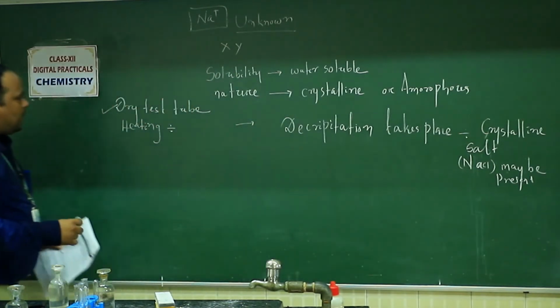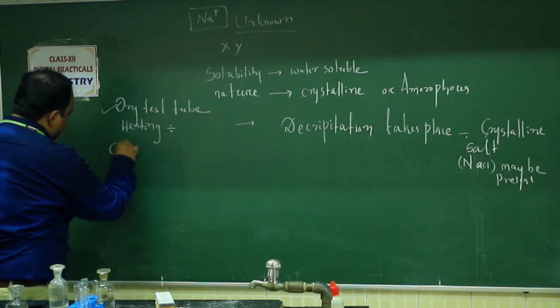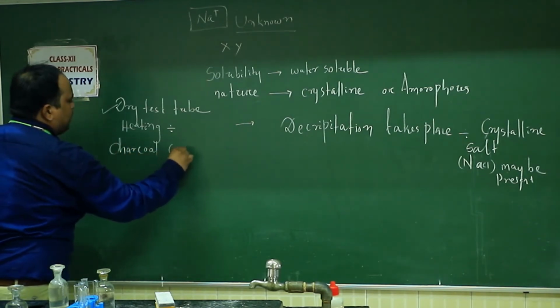Next, after dry test tube heating, you will go for charcoal cavity test.